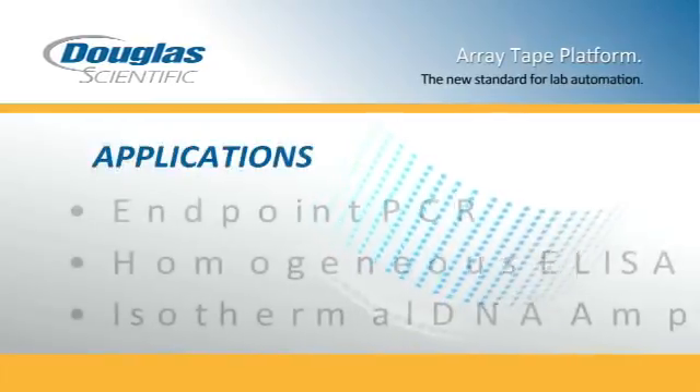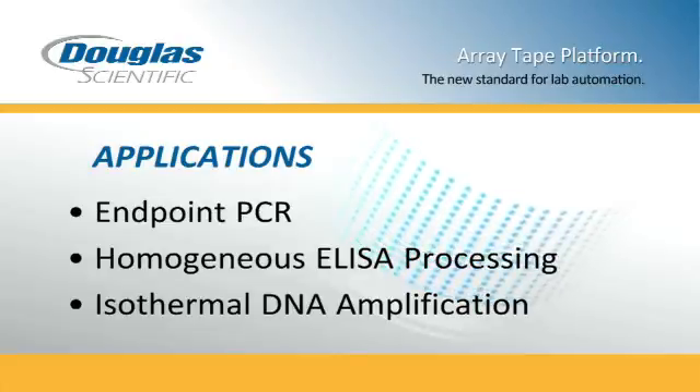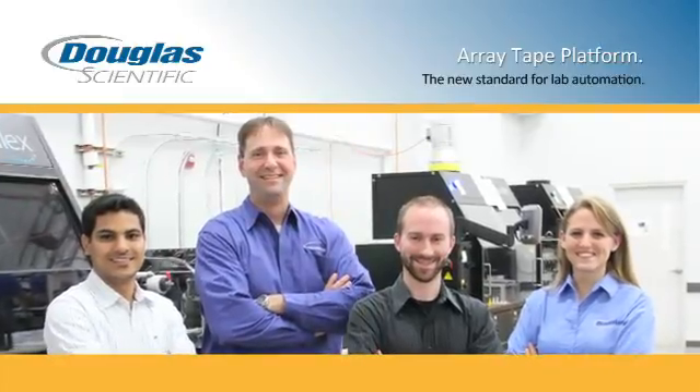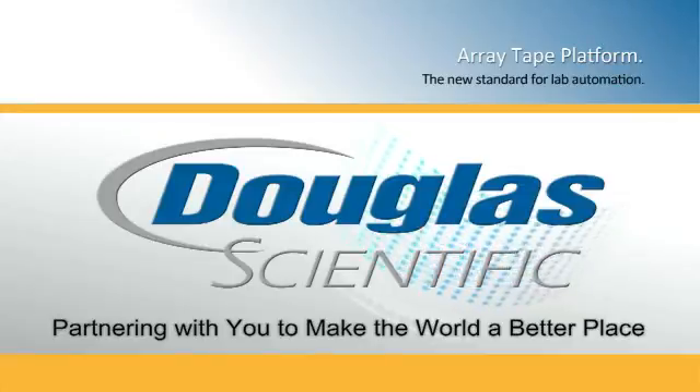the platform also supports homogeneous ELISA processing, isothermal DNA amplification, and more. Put the power of Douglas Scientific innovation to work for you. Douglas Scientific — partnering with you to make the world a better place.